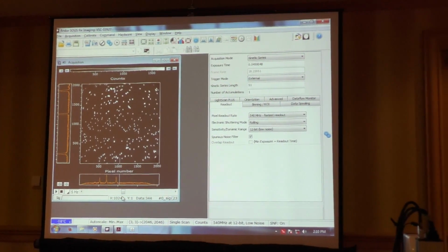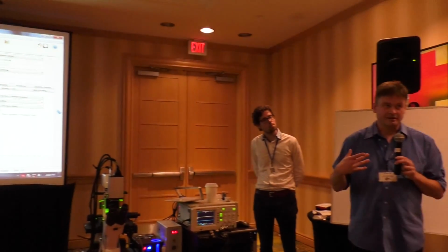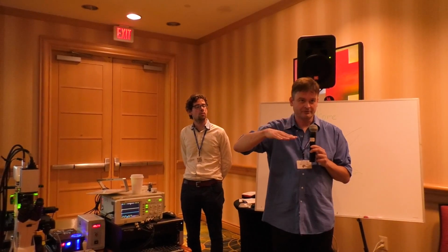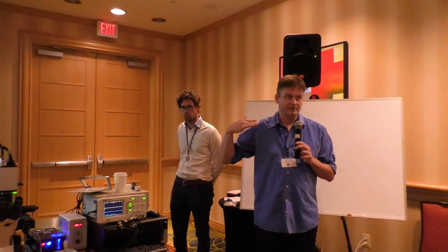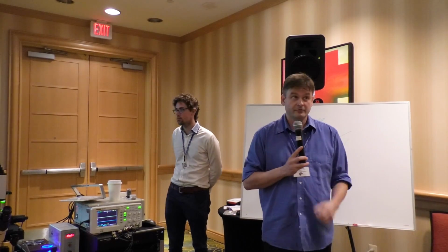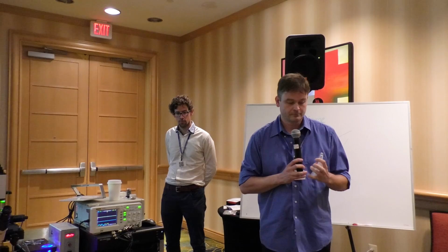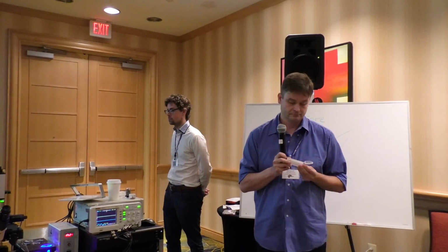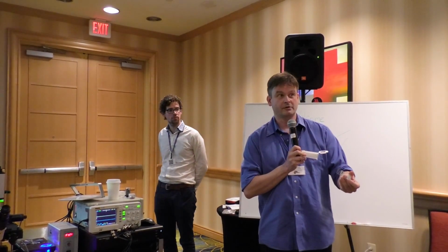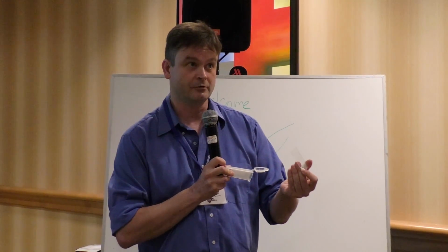You give it with, if it matters for your analysis, you're most likely in a tier of experiments, and we'll get to that in a moment. There, this will be asked for. Okay, now this comes with one reminder though. These slides, well, we have a cover glass, right? And we have a mounting media. And these are not your cells, these are not your samples.